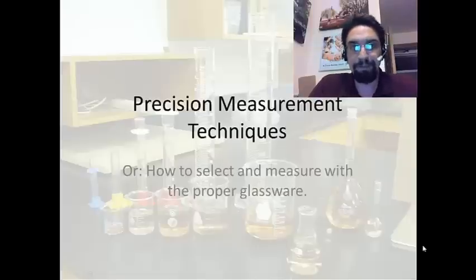Hi, Mr. Kane here. I'm going to be talking to you today about how to make precision measurement techniques, or in other words, how to select and measure with the proper glassware in chemistry lab.